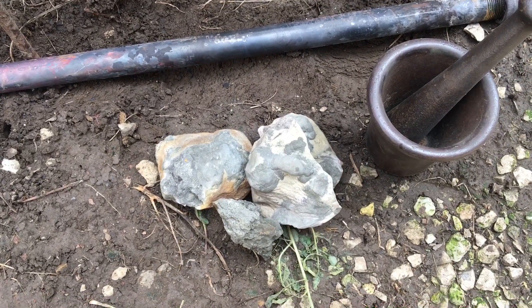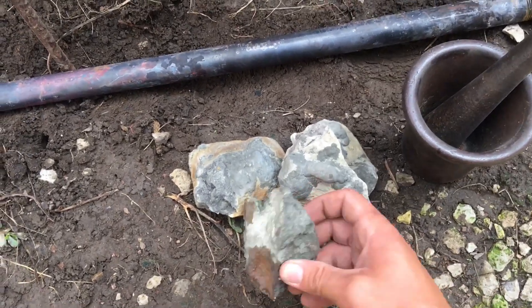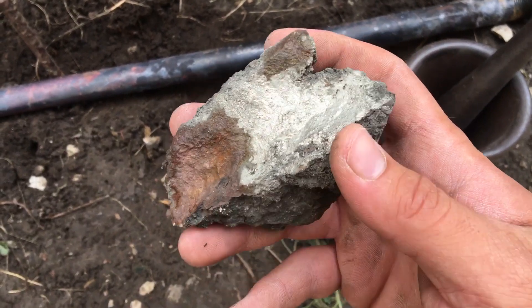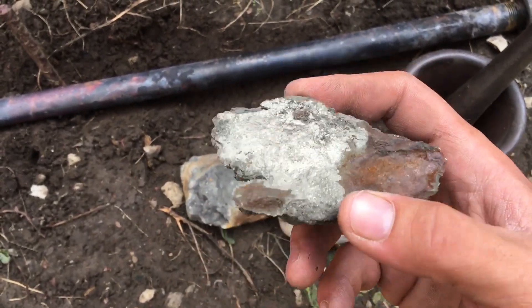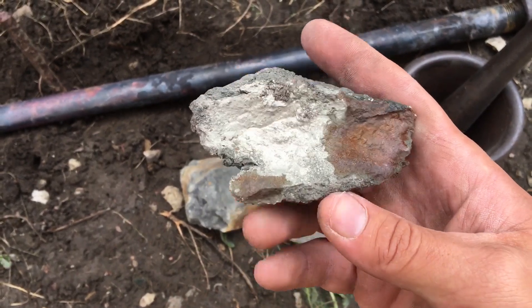Here are some pieces of iron pyrite, or fool's gold, that I found along a river in central Iowa. You can see it's got this nice yellow glittery color to it — that's how it got the name fool's gold. It's actually iron with two sulfur atoms.